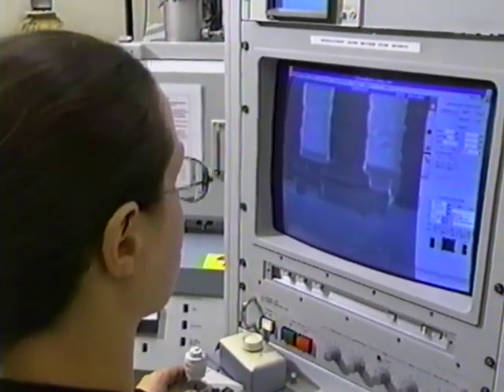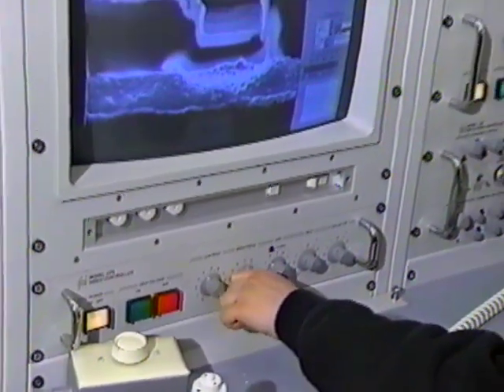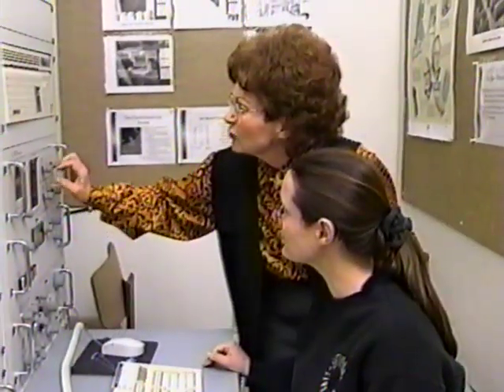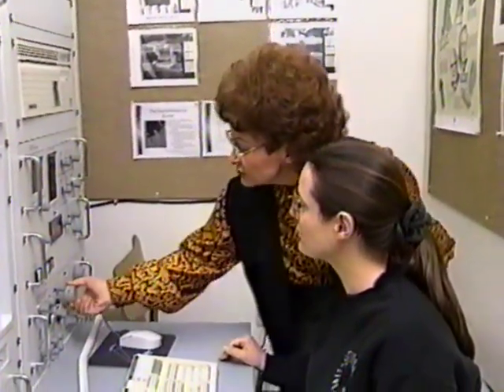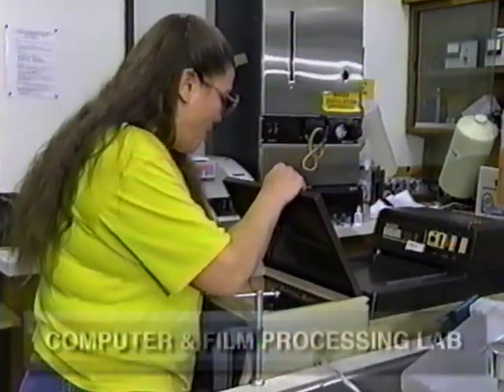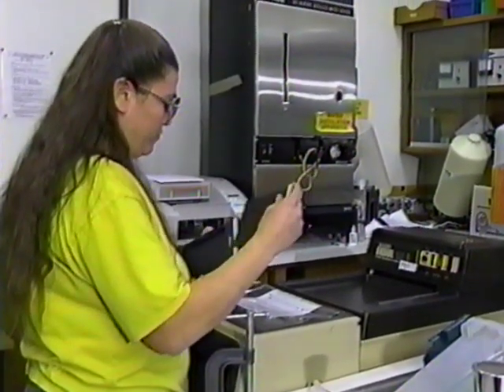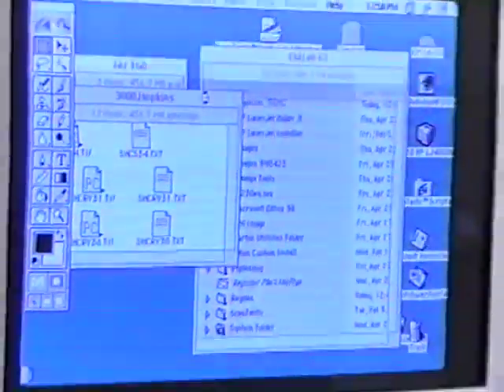You can see on there, there's actually a circuit, and you can make connections where connections weren't before. If you have a connection that's failed, you can reconnect it. So you can redesign circuits. You can prepare specimens even for the transmission microscope and thin them on the focused ion beam. And so this is a marvelous tool, and it's only been around for about 8 years, the tool itself, so it's quite recent.